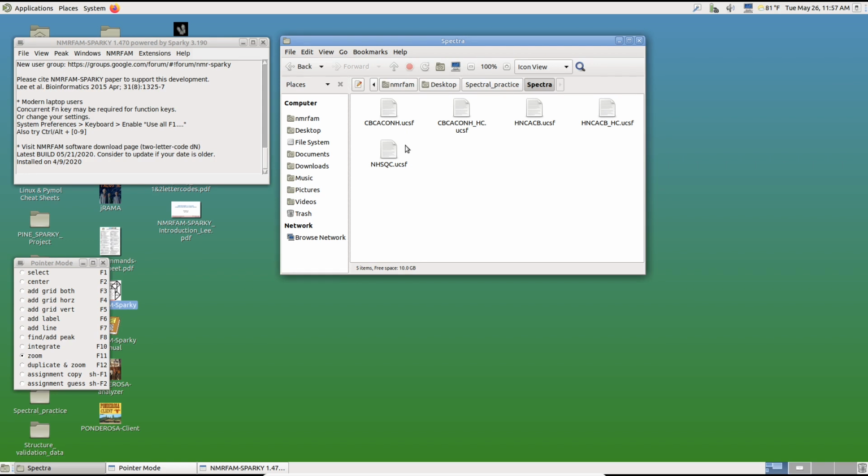You will see that information, but it does not carry any information about analyzed information such as line width, peak position, and assignment, and so on. So the spectrum itself holds very limited information from the data you converted, either with NMRPipe or TopSpin, usually for protein NMR. You can imagine that it is pretty similar to an image.